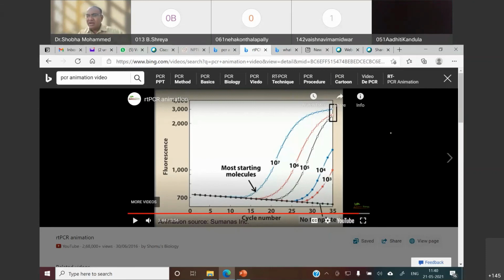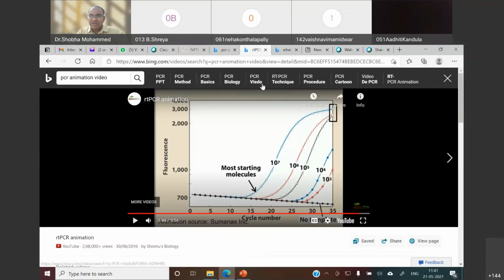The DNA will tell me which type of nucleotide it is having, and then the fluorescent that is taken in. One virus will take one, another will take another. The load, meaning the number of molecules of this particular DNA synthesized from the mRNA of that particular antigen, will give me the load. So I can do the quantification. Then I say whether the person is affected or not affected. Hope that you have understood here.